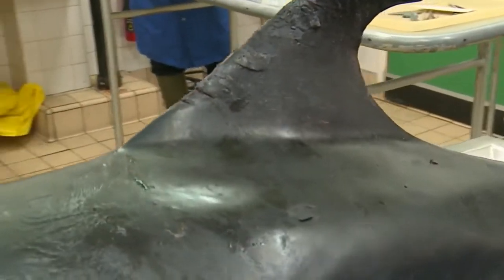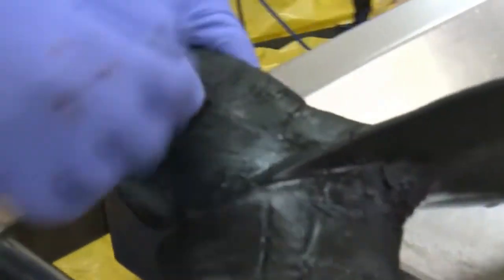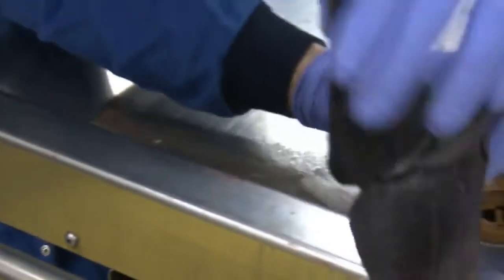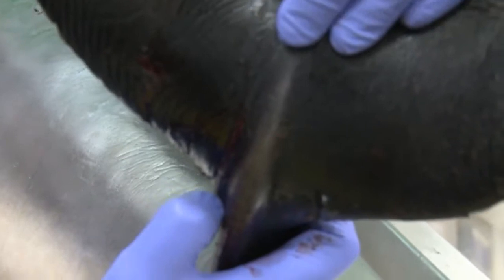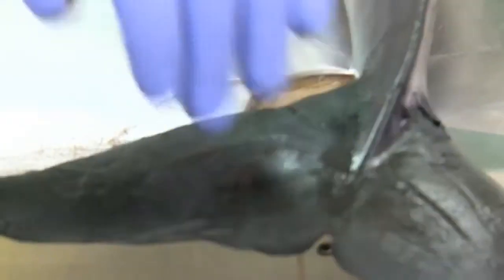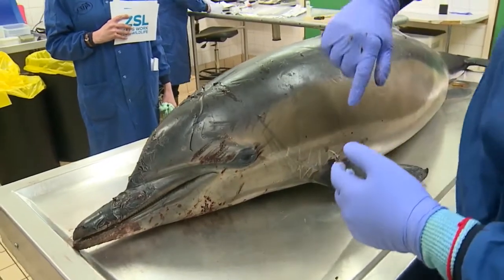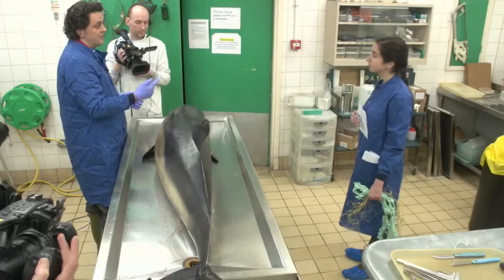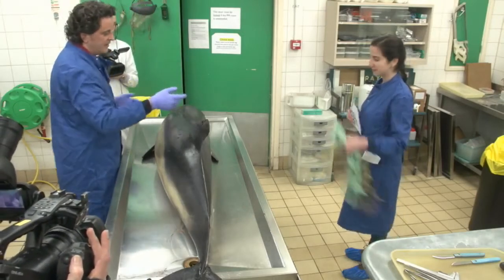And again, going further back around the tail fluke, we've got some bleeding linear cuts just over here. And if I lift the tail up, much more obvious, got one running that way. Okay, and there are also some more on the underside of the body too. So it's heavily covered in these linear man-made lesions, which are consistent with net marks. So what we've done already is measured the circumferential ones in particular. They're really useful in terms of trying to diagnose the kind of gear they get caught in. Perhaps if I can illustrate that.